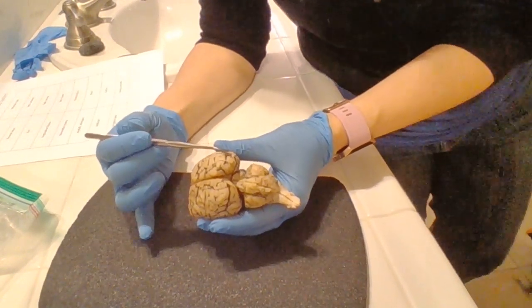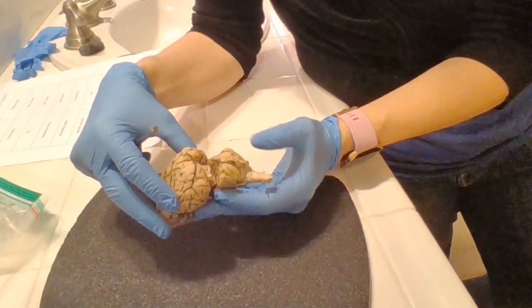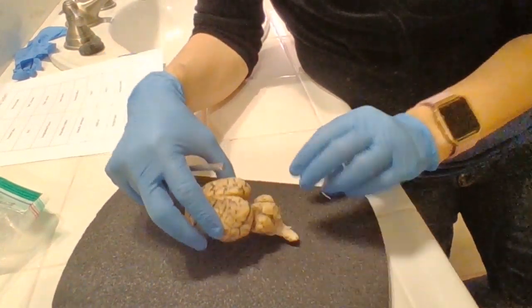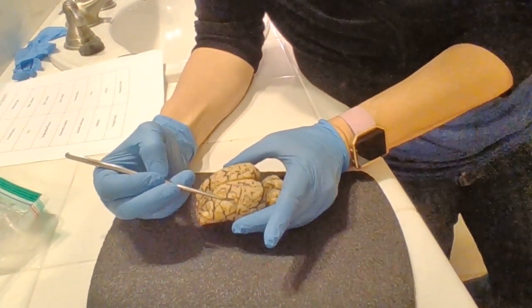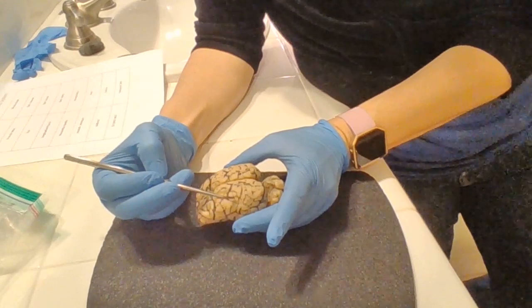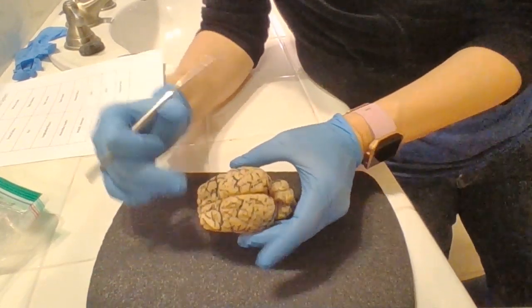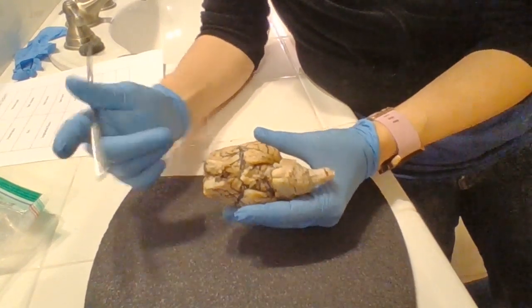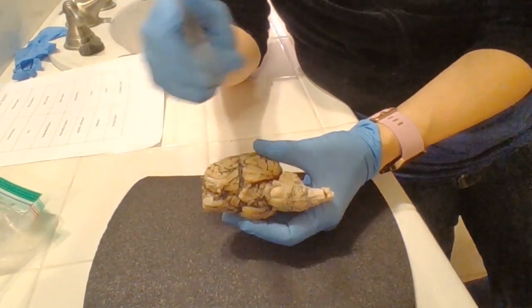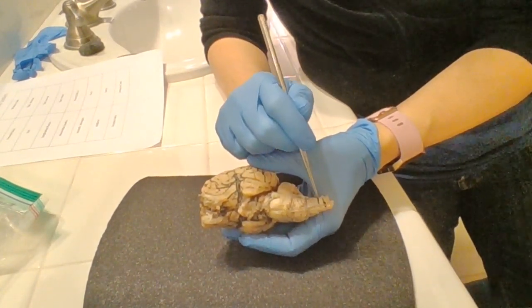Back here is the cerebellum, also known as the little brain. Look right here. These little tiny lines right here are the gyri, and right here are the sulcus grooves. And I'm going to go to the ventral part of the brain. We're going to start right here. Brain stem is back here.